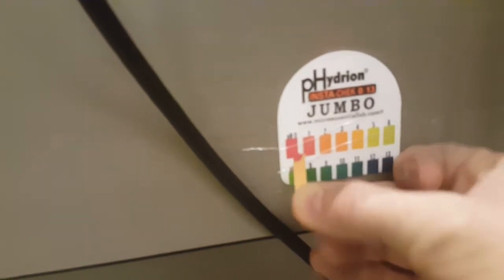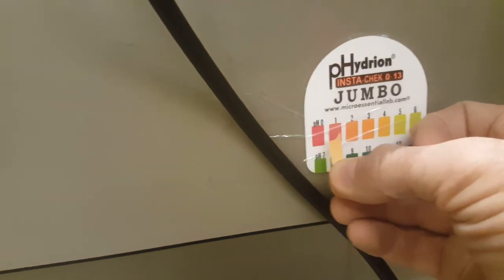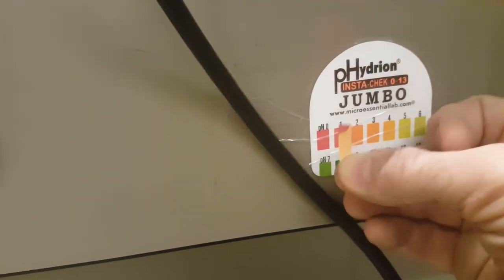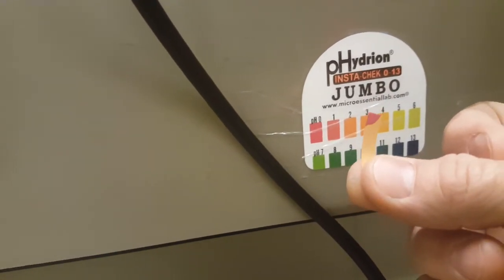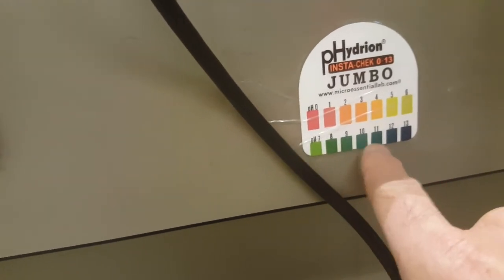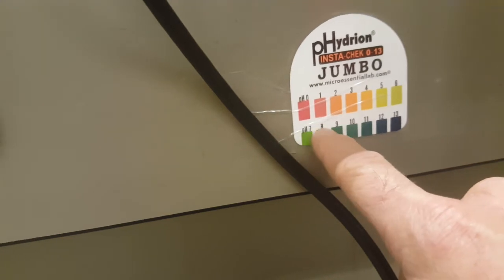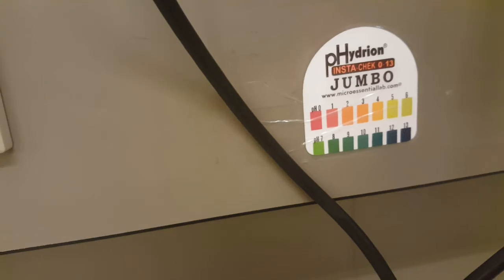At the end of your lab bench, there's a color guide, and you can see that that acid has a very, very low pH, somewhere in between 0 and 1. We're going to use this pH paper one more time once we've passed into equivalency or through equivalency, and we hope to see the pH be a basic color, somewhere between 8 and 10, when the phenolphthalein turns completely pink.